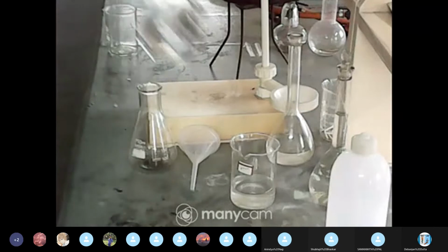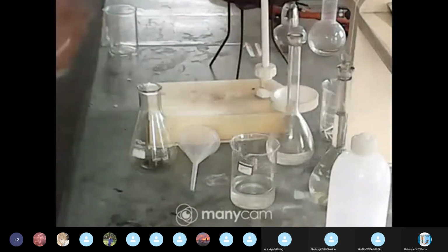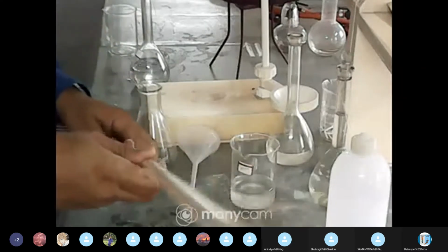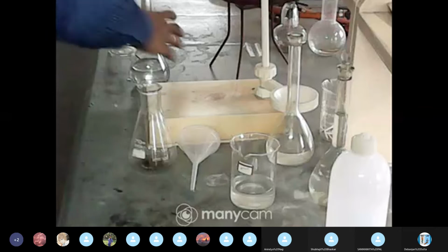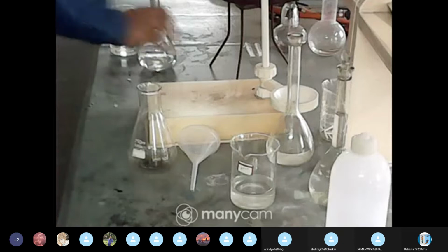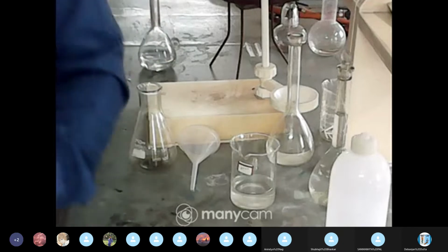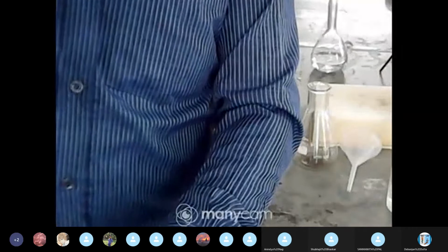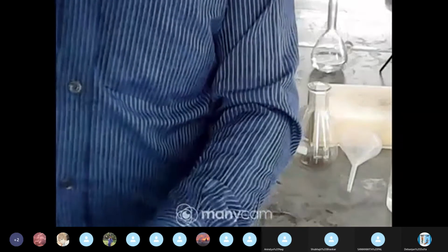This is the HCl. It will be supplied to you. The burette should be filled with that HCl. When you transfer the HCl, a beaker will be given there. Just observe how this is done and transfer it in that way. Every time, make sure that the mark is on 0.